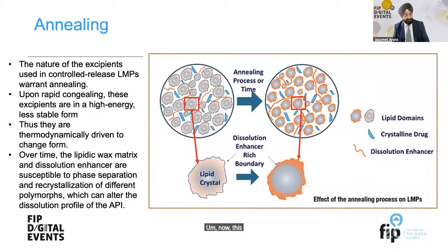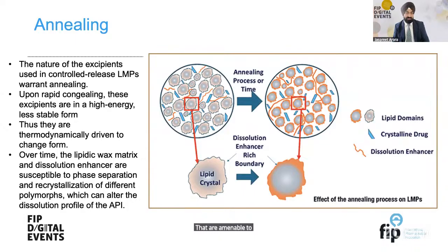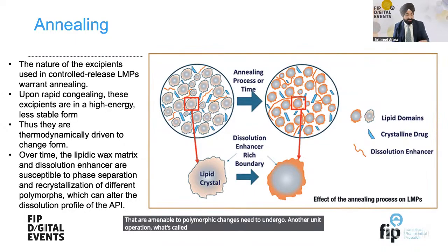Now, this is where things get very interesting. Some lipid multiparticulates made with lipids that are amenable to polymorphic changes need to undergo another unit operation, what's called annealing.